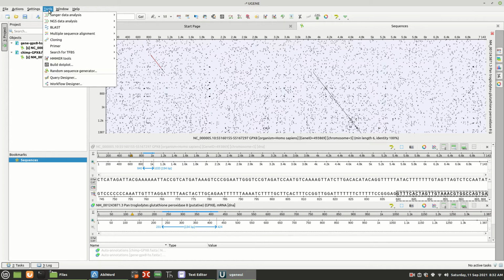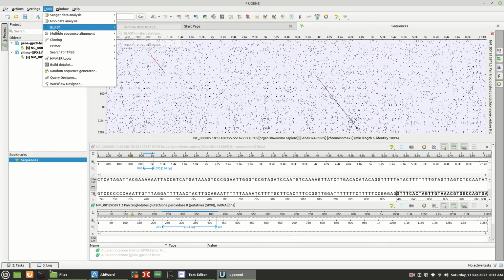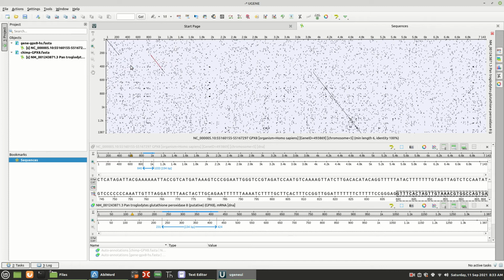There are tools here, and let's see here. We can go to Tools, and we can do RNA. Let me find it. We can do a BLAST here. From here, it'll go do it. But I want to do a sequence alignment. And me personally, these are all essentially different ways to do the same thing, which is to find an alignment. I like K-align.